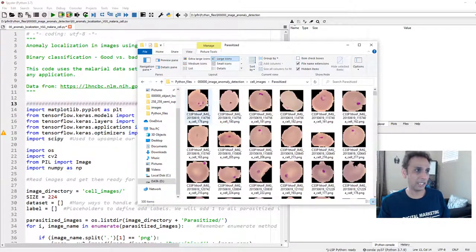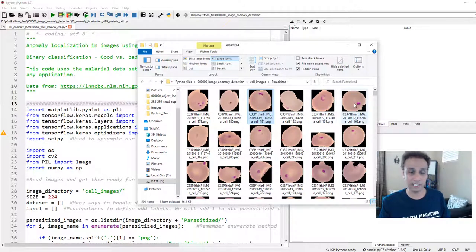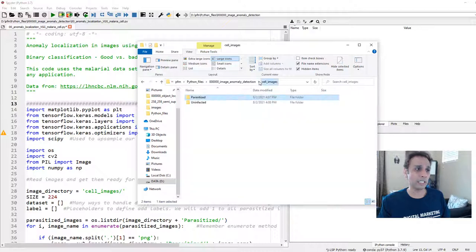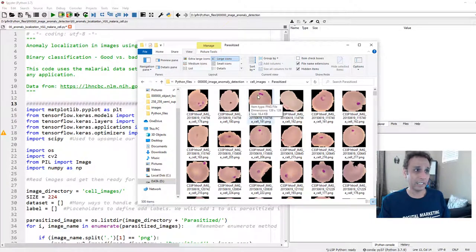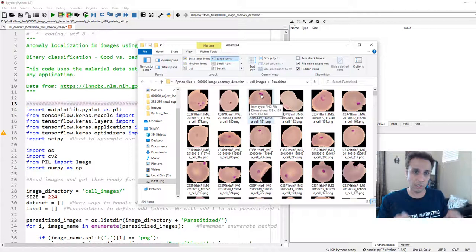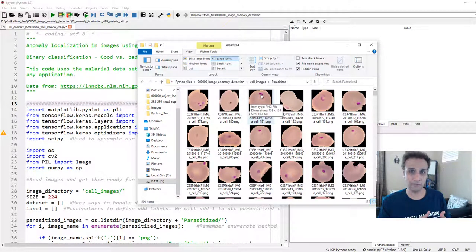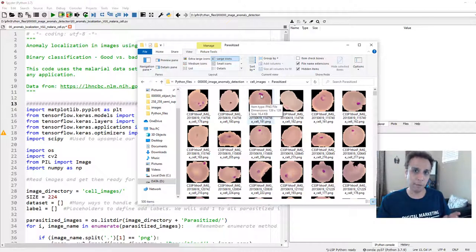If you go to 'parasitized,' it looks very similar to uninfected, except you can see some parasites. We are going to set this up as a binary classification problem, and the idea is when we load a parasitized image, the model should highlight where the parasites are and draw a box. It can be one or many parasites — just show them as hotspots with a red box around each. That's the plan.